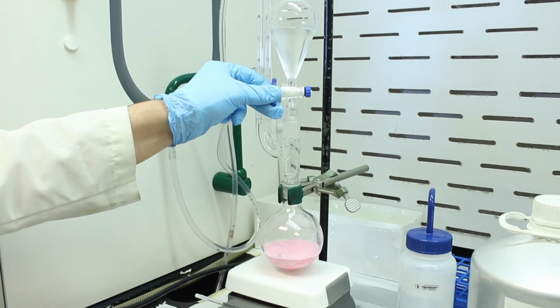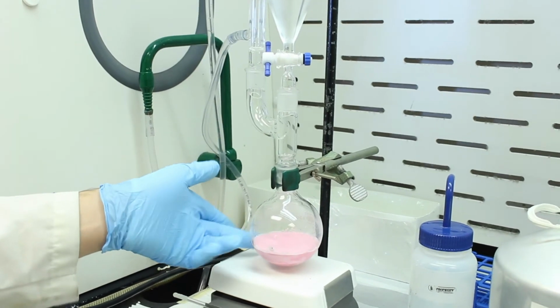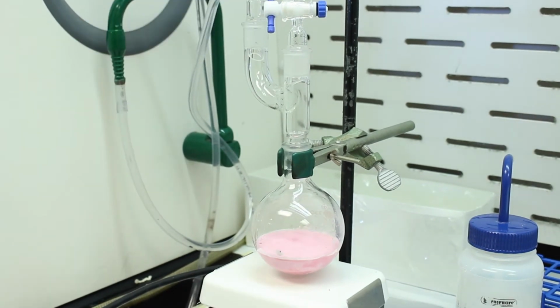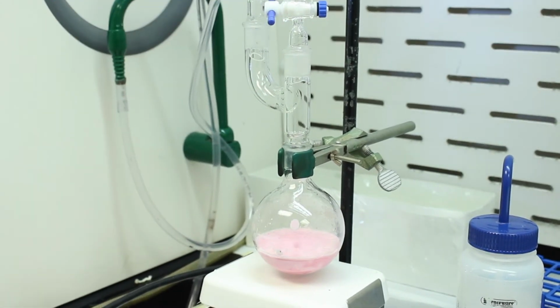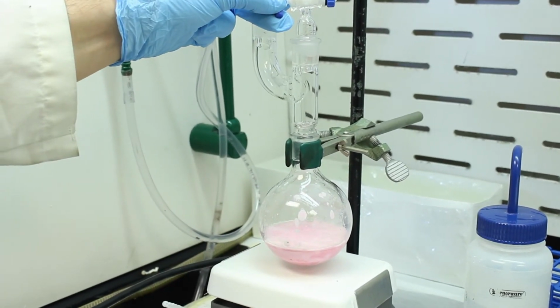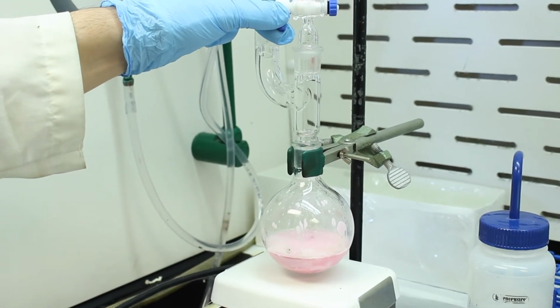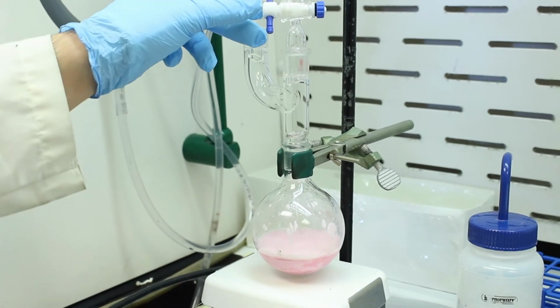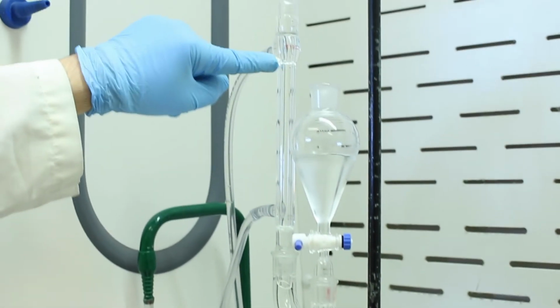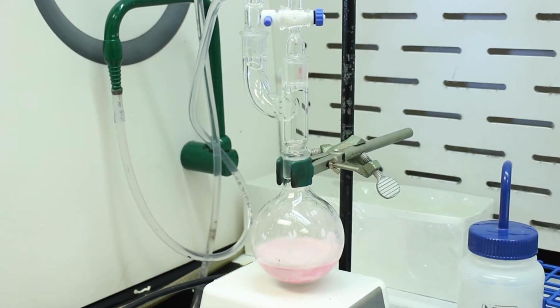We found that if you go slowly in the addition here, it dissolves better. And when this occurs, it will probably get rid of this pink color, and it will turn into a sort of light color biphasic system. There'll be an aqueous layer, so you can already see it's bubbling vigorously. There'll be an aqueous layer at the bottom and an ether layer at the top, the organic layer. And we're trying not to overwhelm the condenser here. You can see the ether is climbing very rapidly because this is the most exothermic step out of all the steps.